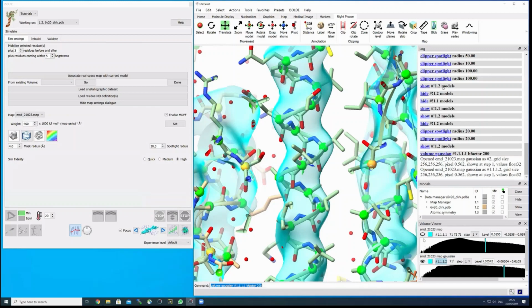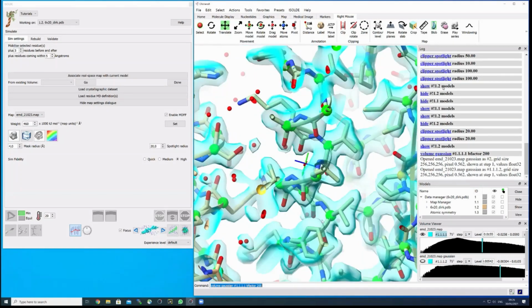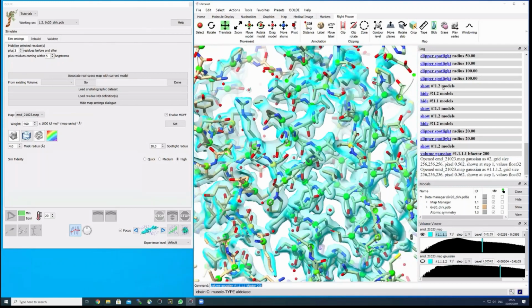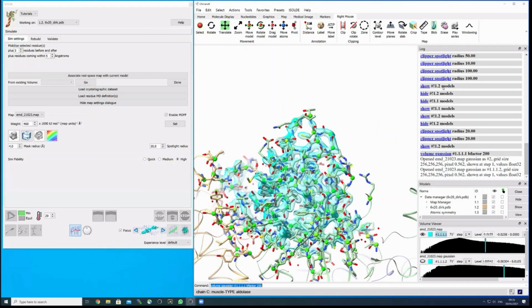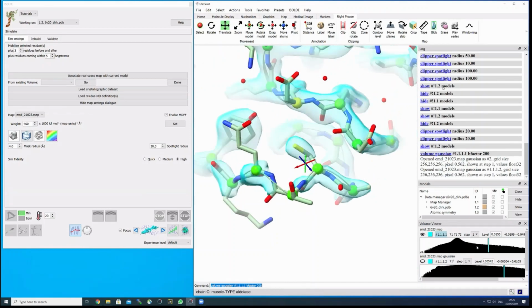So now I have down here 2 maps, and I can switch between them. So whenever I want to use the high resolution features for model building, I use the high resolution map with the appropriate B factor. And if I want to see areas, for example, loops at the outside, which at a certain sharpening factor may disappear. We see this, for example, here at the periphery, that the density smears out with a given B factor.